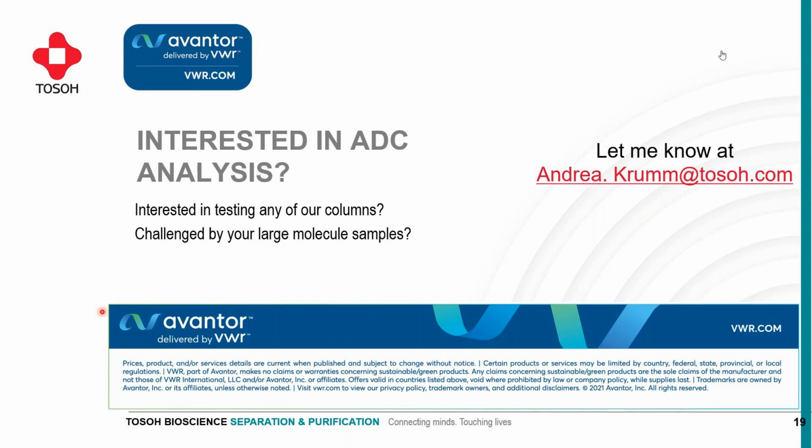Sure. The first question coming from Germany: which detection wavelengths do you typically use for ADCs?